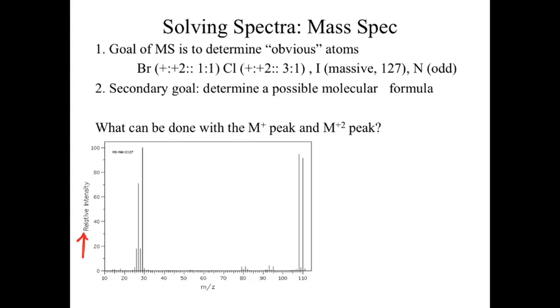We've got an instrument that separates these pieces based on their mass, and so the instrument just detects: something hit me, something hit me, something hit me, and that was all at roughly 2 seconds. So it's going to correlate those 3 things that hit it as a slightly taller peak than if nothing hits it at 4 seconds. Kind of makes sense?